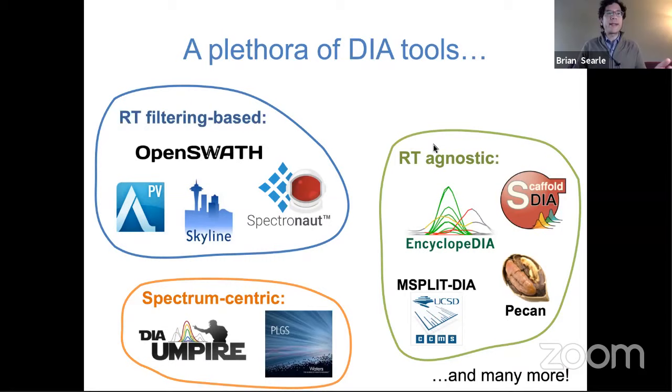And then contrast this with tools that are designed to use the original DDA-like platform for analyzing data using search engines. Tools like DIA-Umpire or PLGS from Waters are great ways of interpreting DIA data as well.